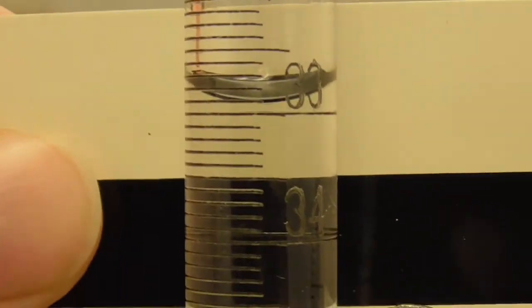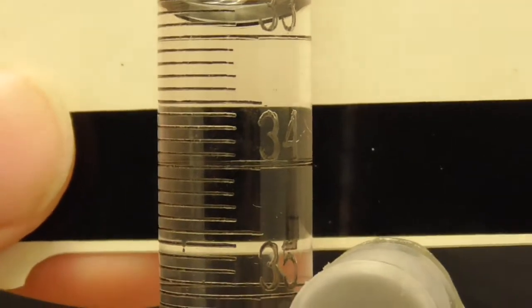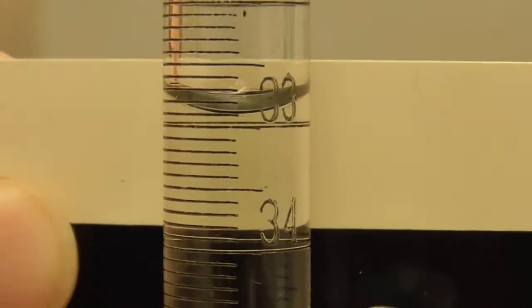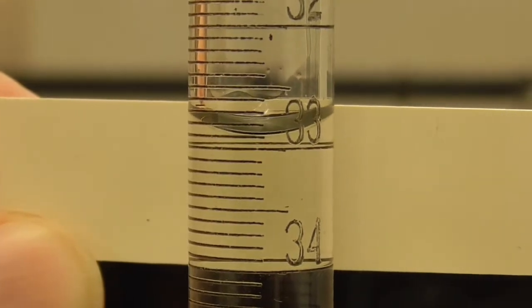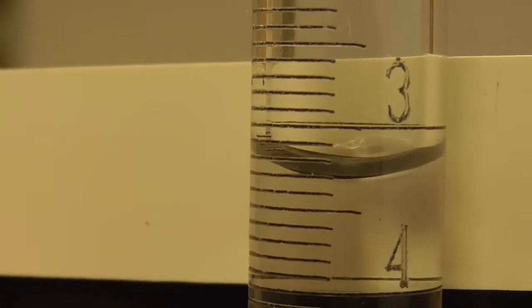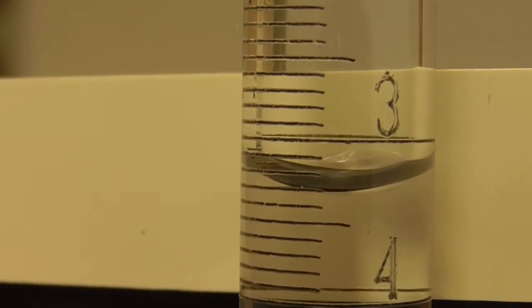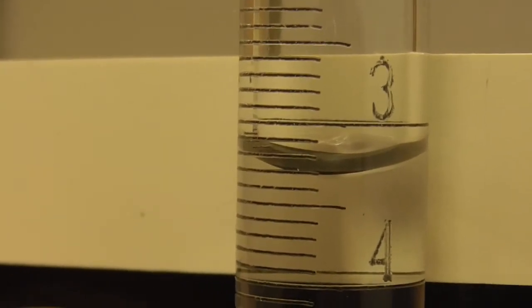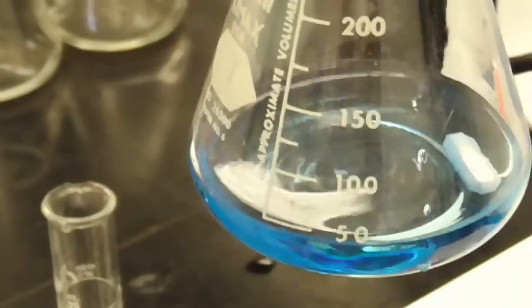And Dr. Dene, could you lower that card a little bit? Okay, all right. One down, 3 more to go. Here's the beginning point on the burette for trial number 2. And here is our sample. We've already made the sample. Go ahead and put it under the burette.